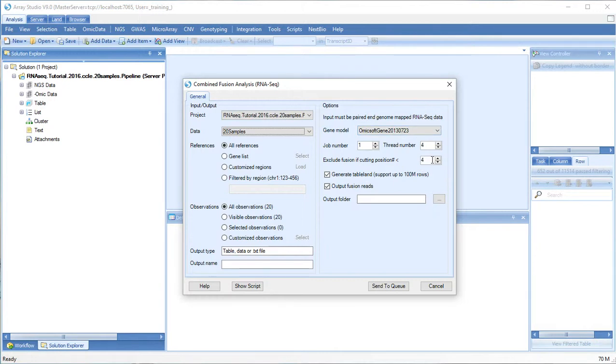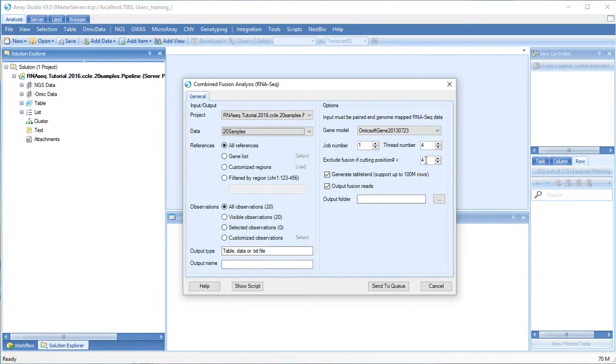By default fusion events will be reported if they have at least four different reads defined as where the read is cut to map to the different genomic locations. You can change this value depending on how stringent you want your search to be.